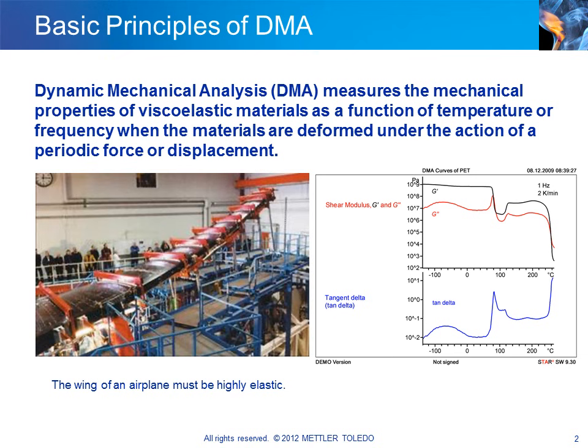The diagram on the right shows the results of a DMA measurement of PET in the shear mode. The curves display the storage modulus G', loss modulus G'', and tan delta as a function of temperature.